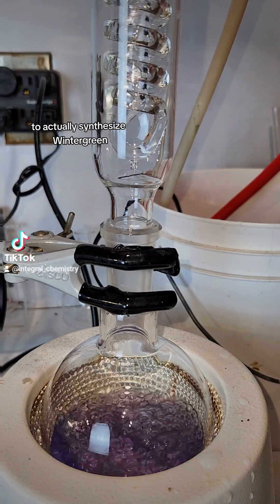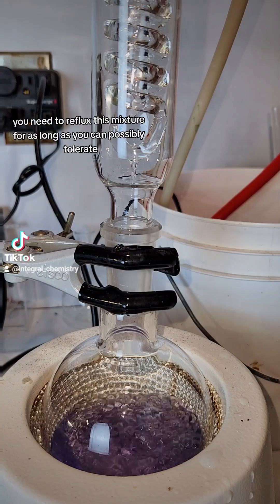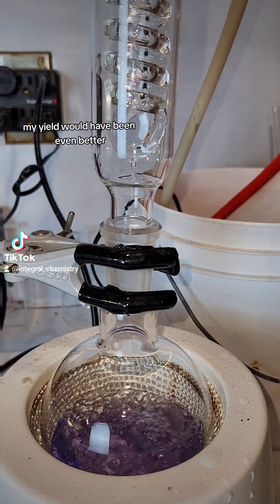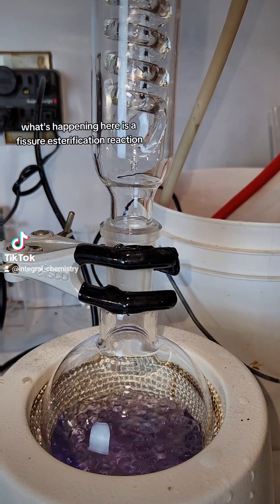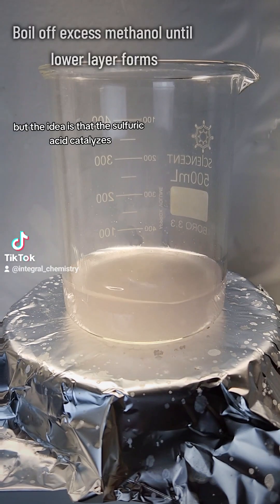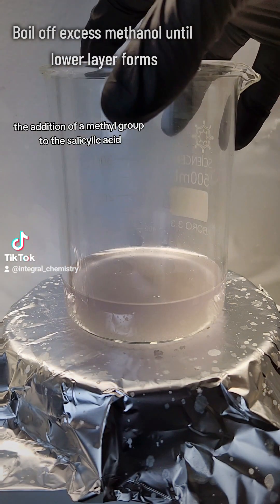To actually synthesize wintergreen, you need to reflux this mixture for as long as you can possibly tolerate. I did it for two and a half hours, but if I had gone longer, my yield would have been even better. What's happening here is a Fischer esterification reaction, which I've covered several times on this channel, but the idea is that the sulfuric acid catalyzes the addition of a methyl group to the salicylic acid, forming methyl salicylate.